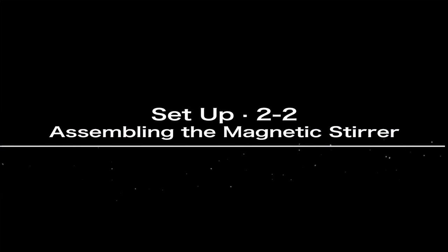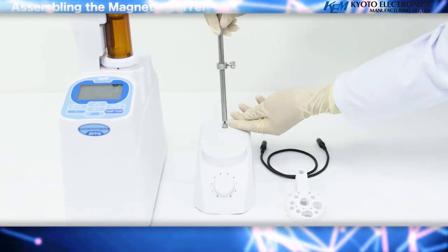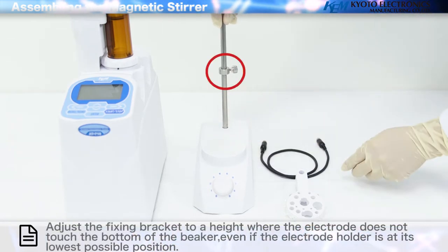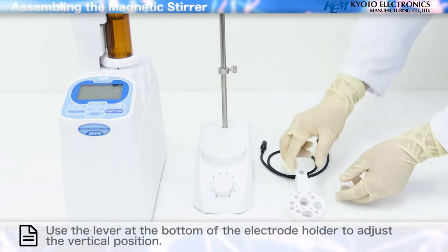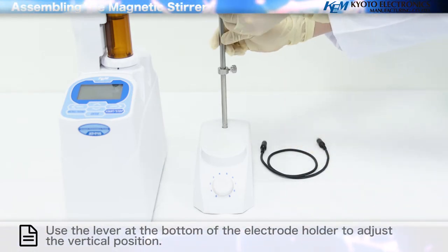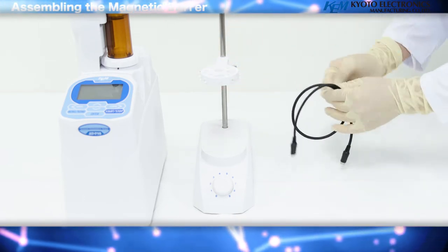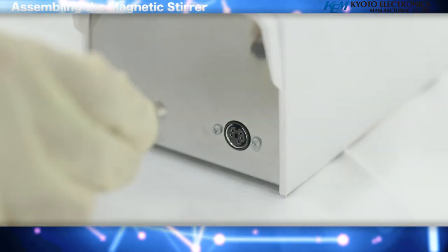Assembling the Magnetic Stirrer: screw the stand bar firmly into position as shown in the diagram. Adjust the fixing bracket to a height where the electrode does not touch the bottom of the beaker, even if the electrode holder is at its lowest possible position. Use the lever at the bottom of the electrode holder to adjust the vertical position. Then insert the connector of the stirrer cable into the back of the magnetic stirrer.